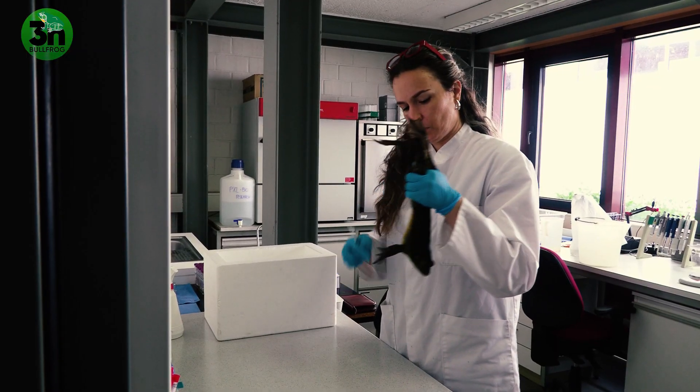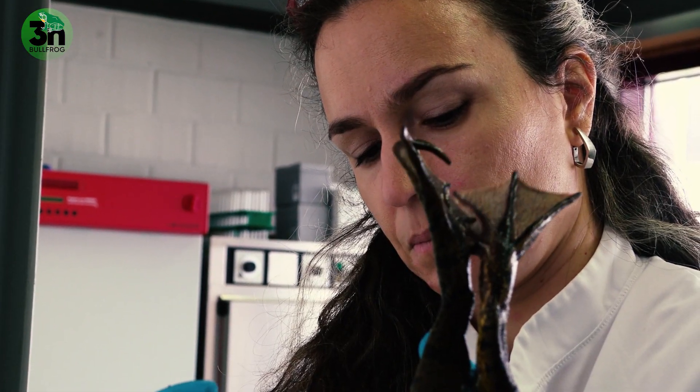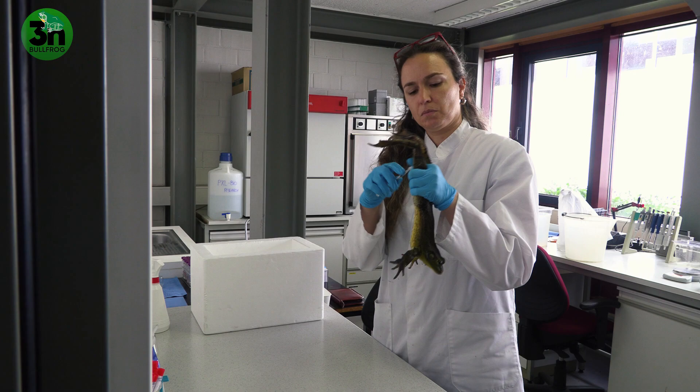In the process of hormonal stimulation, on the third day we have the extrusion of the eggs. But two hours prior to that extrusion, we inject the males with a hormone to induce the spermigenation and to have a higher concentration — a higher yield — of spermatozoids. This we do to enhance the yield of fertilization.